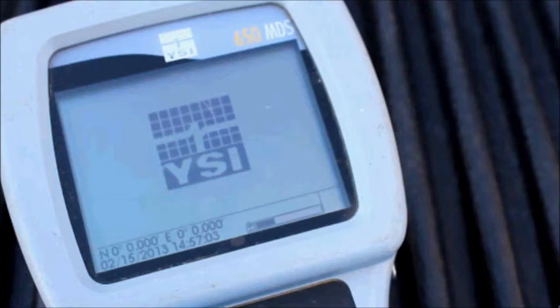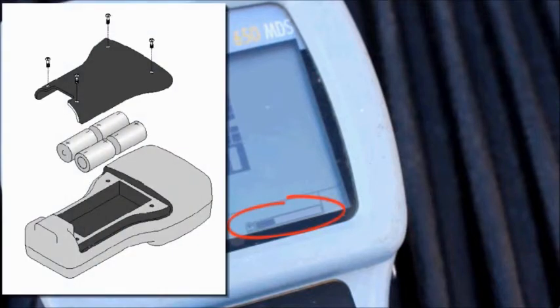During your monitoring event, after you have connected the 650 display to the sonde, you may notice that the battery indicator is low. We suggest that you install new C-cell batteries to avoid problems related to low voltage supply to the sonde.